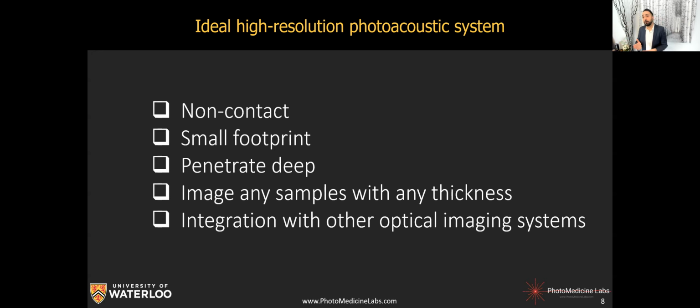And if we have an all optical imaging system, in other words, if we didn't have that ultrasound transducer, then our microscope, this very exciting microscope that we show how important it is, how novel it is, and how unique it can be, can now look like any other microscopy systems that we are familiar with, which usually are non-contact. You do not see any transducer. You do not need to touch the sample. Usually there are some lenses and the sample, and basically that's it.